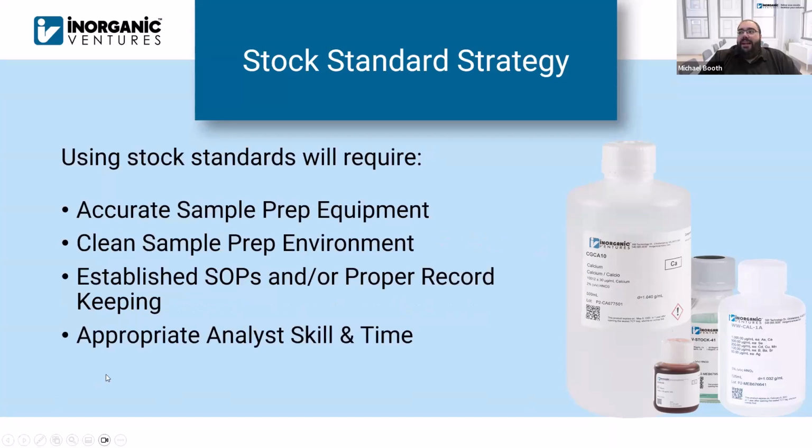If you are using a stock standard approach, there are a few things to keep in mind, right? Because these are not pre-made standards, you have to do some preparation on them to get them to run. So when you do that, you need to make sure you have the proper equipment to prepare standards accurately. Make sure you have a clean environment, again, to cut down on that contamination risk. And make sure you're using established SOPs and you have the proper record keeping procedures in place. And that's really important for audits.